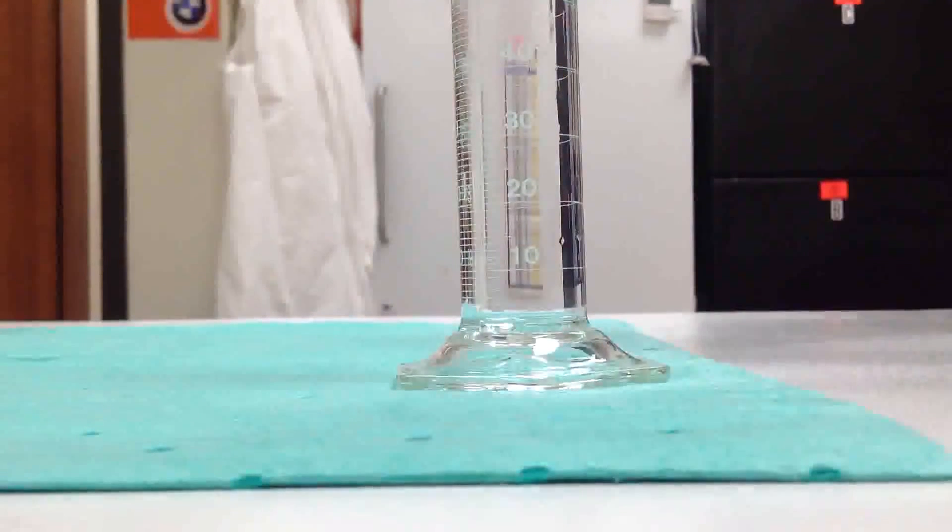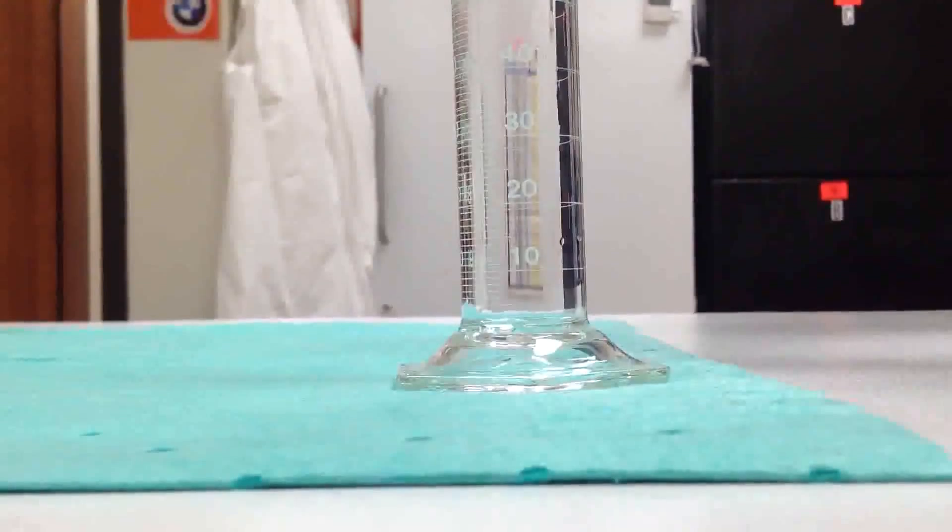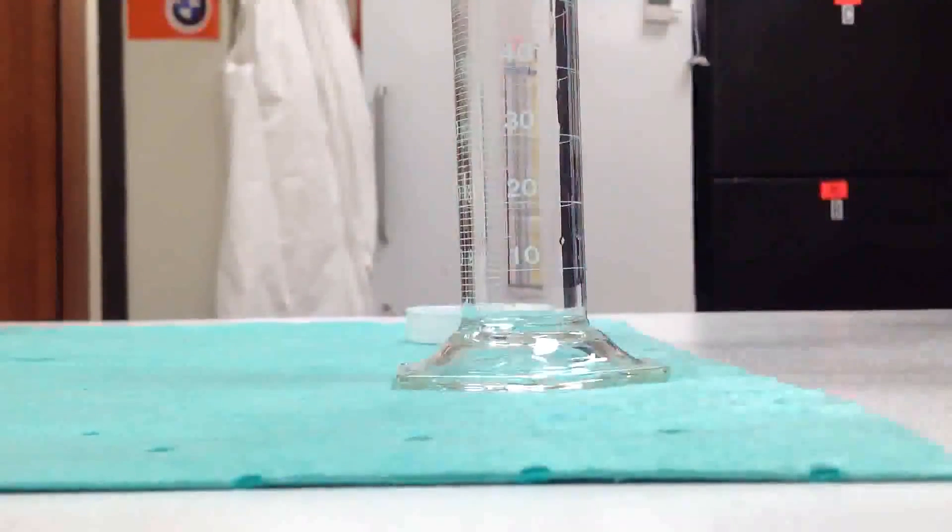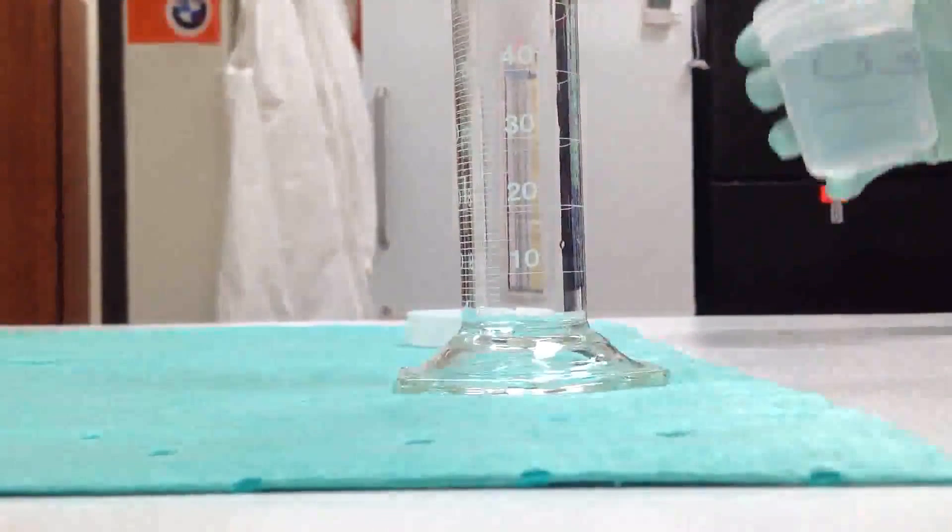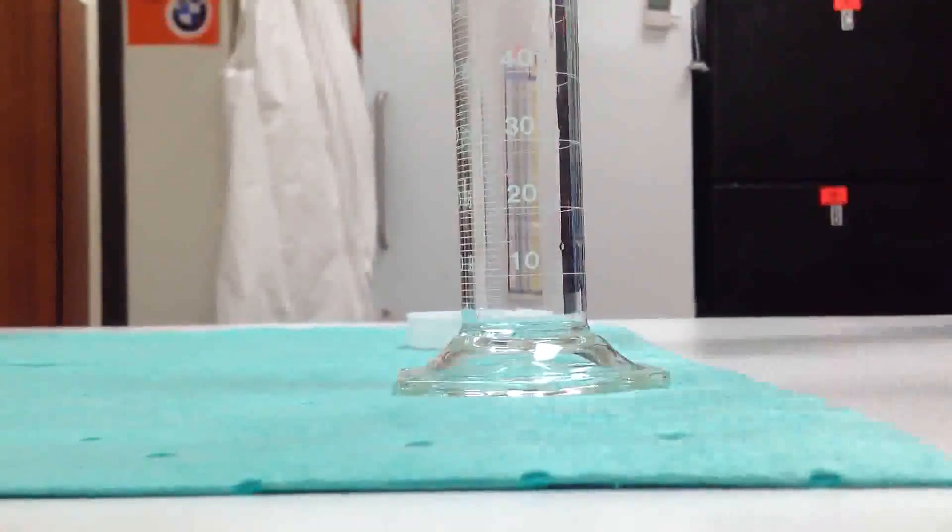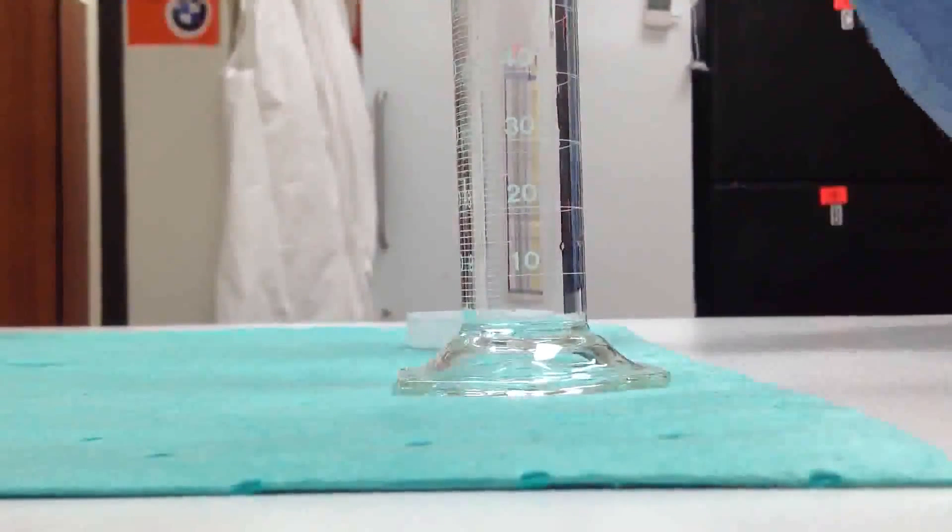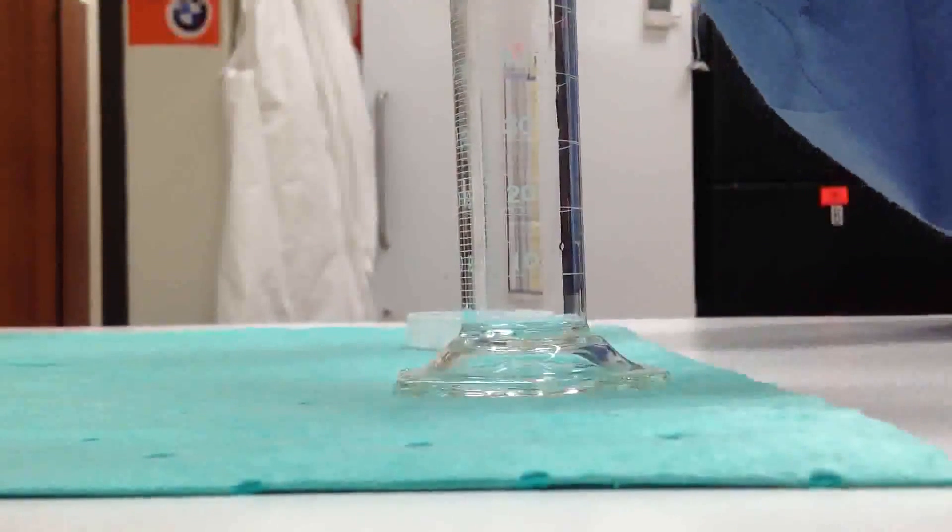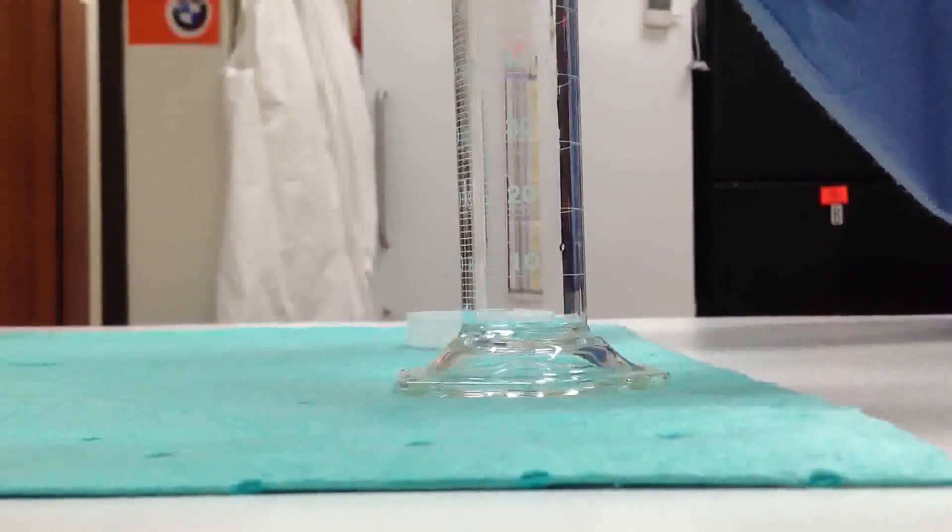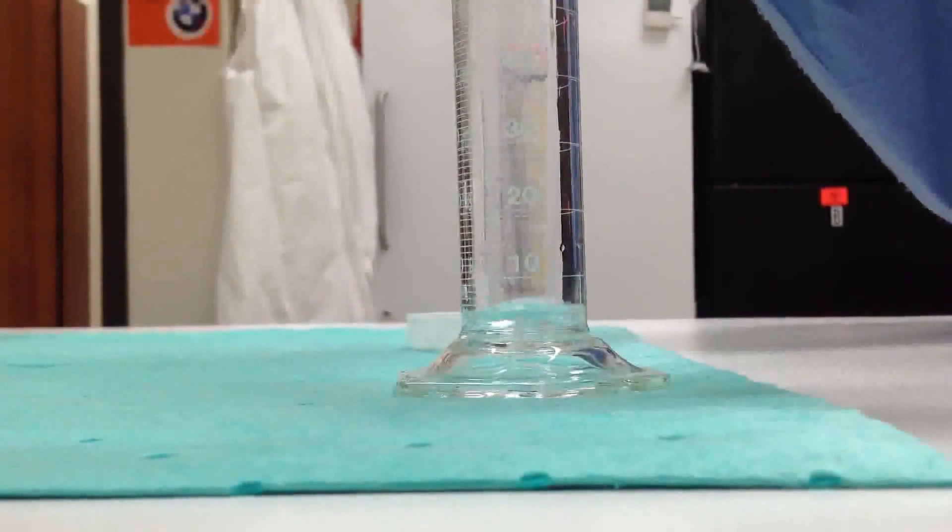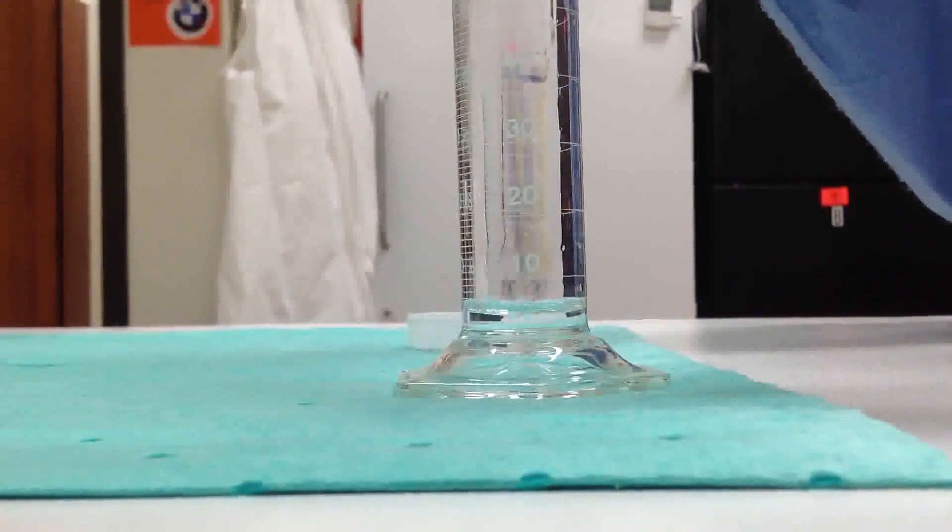You can see the major increments with circles almost all the way around are indicated in groups of 10, with each mark in between for 1 ml. We'll pour the bulk of our solution into the cylinder just slightly below our intended mark.